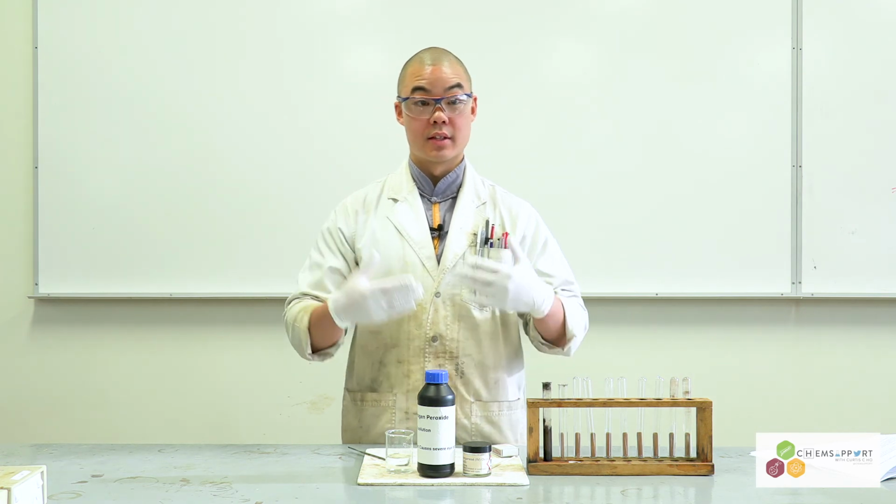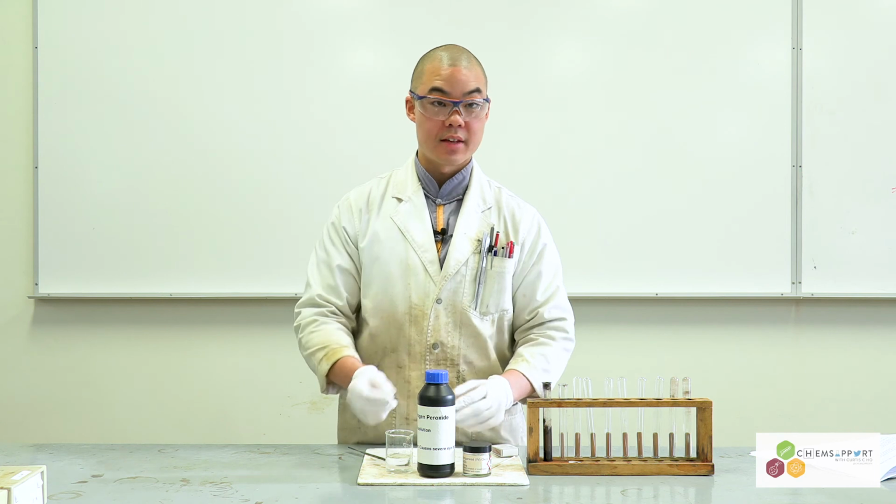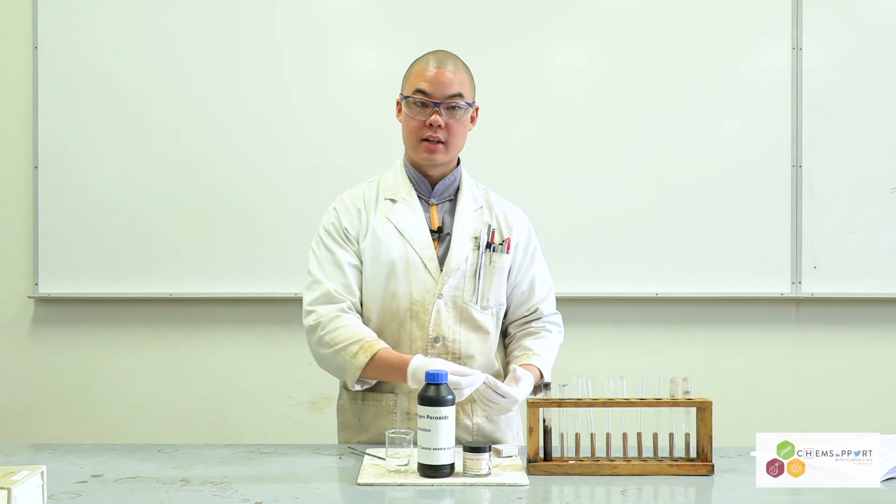So there you have it. It's a decomposition reaction, a very classic test for oxygen gas, and I hope you enjoyed it.